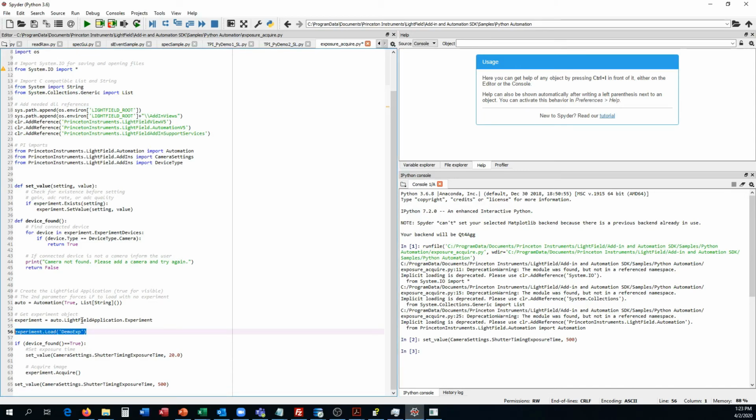So that covers the topics that we wanted to get through. We've introduced the library of reference material and the sample code, and showed you how to access this documentation in these sample codes. We've walked through this sample. We've discussed how to avoid the common pitfall of duplicating this automation object and then losing the connection to the camera you had open. And we've demonstrated the use of a software emulated demo camera. So that concludes the demo.